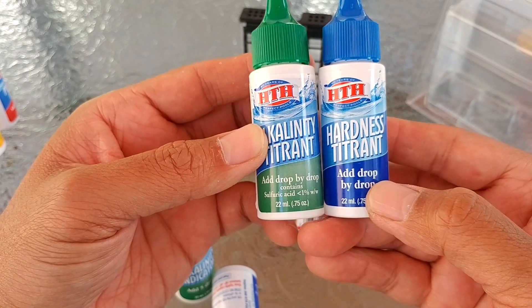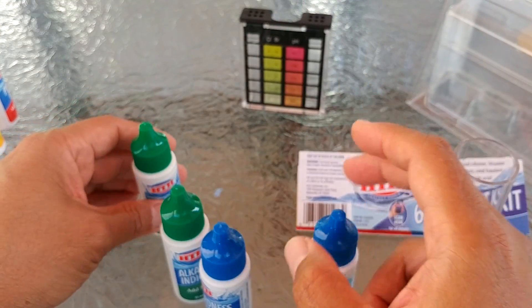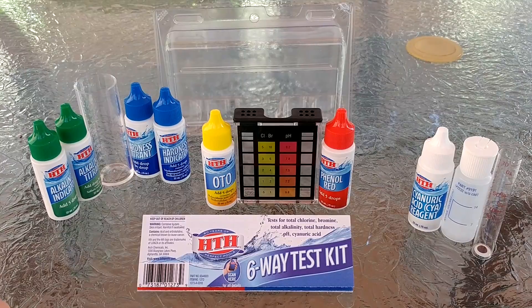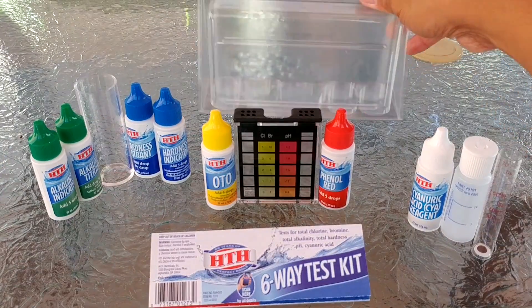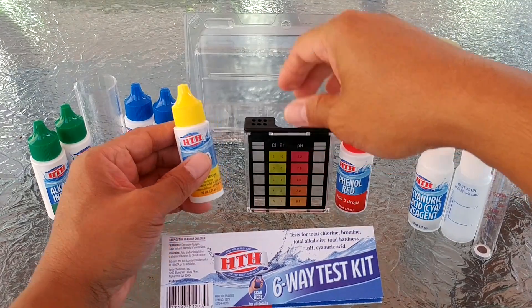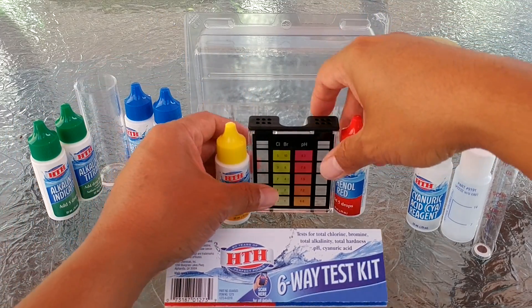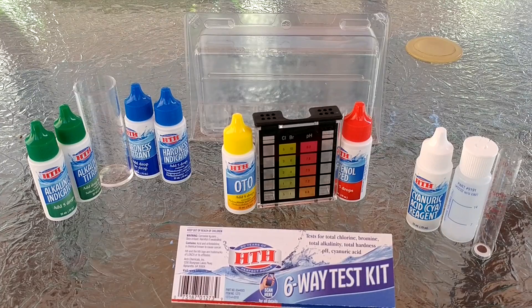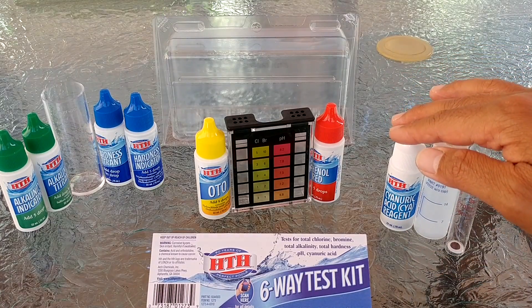Right now I don't see any refill reagent that HTH is selling — they always sell this by the kit. So this is everything that comes in the package: your user manual, the little container, your test tubes and reagents to test your chlorine, bromine, and pH, the tube to test your alkalinity and hardness indicator, and also the tube and container to test your cyanuric acid.